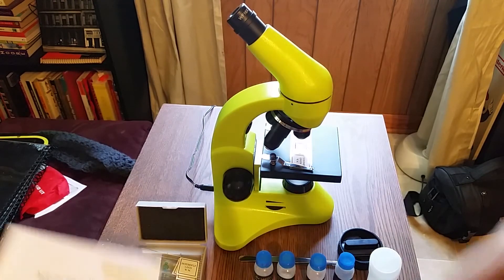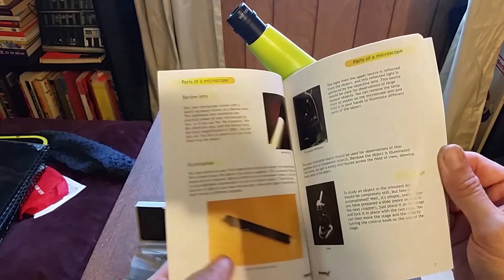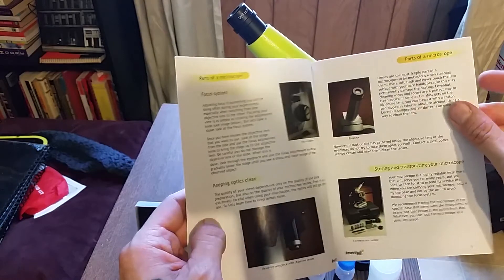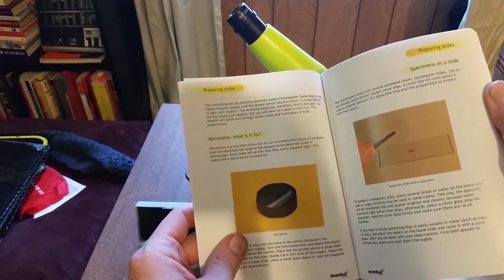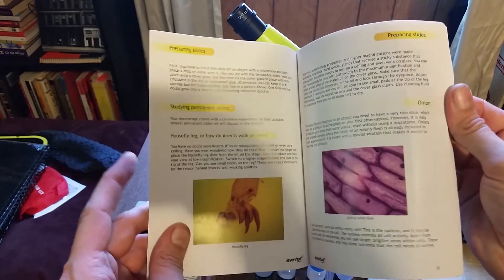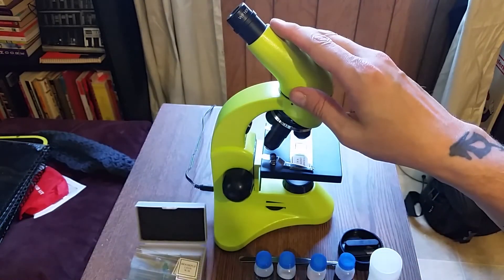You also have a book called 'Scrutinizing the Microorganism,' which serves as an interesting user guide. It walks you through a lot of stuff including illumination. I thought it was pretty interesting because it treats you like you don't know anything about a microscope — it covers parts of the microscope, illumination, how to store it, and so on. The sections on the microtome and preparing slides were really interesting. A lot of times when you pick up something like this, that guidance doesn't come with it, so I think it makes this a lot more user-friendly.